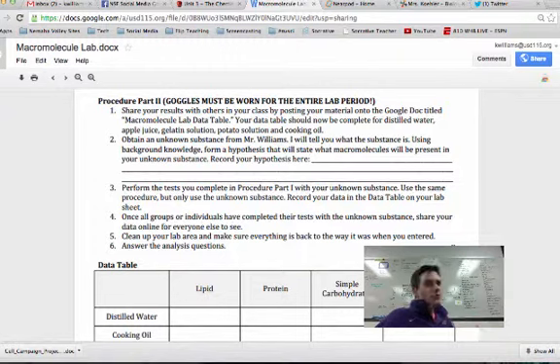And then you're also going to have some mixed results with a few of the tests as well. So you're basically building your background reference knowledge here for part 2, which is all about identifying whether milk, oatmeal, or yogurt is going to be the best solution to fight off the zombie apocalypse. So reading through procedure, part 2 right here, I will give you milk, yogurt, or oatmeal, and you'll go ahead and perform each one of those tests on it.